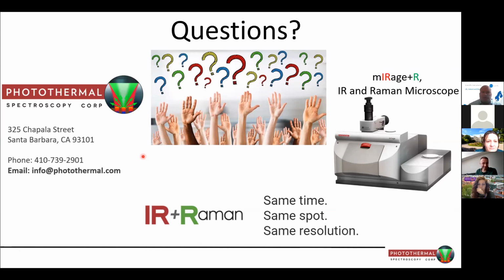There was a good question that I think is very important also for the presentations and demonstration. What is the penetration depth for this technique? Given how often I'm asked that question, I really should include that in my slide deck. It's one of these questions that I'm going to answer by saying it depends.